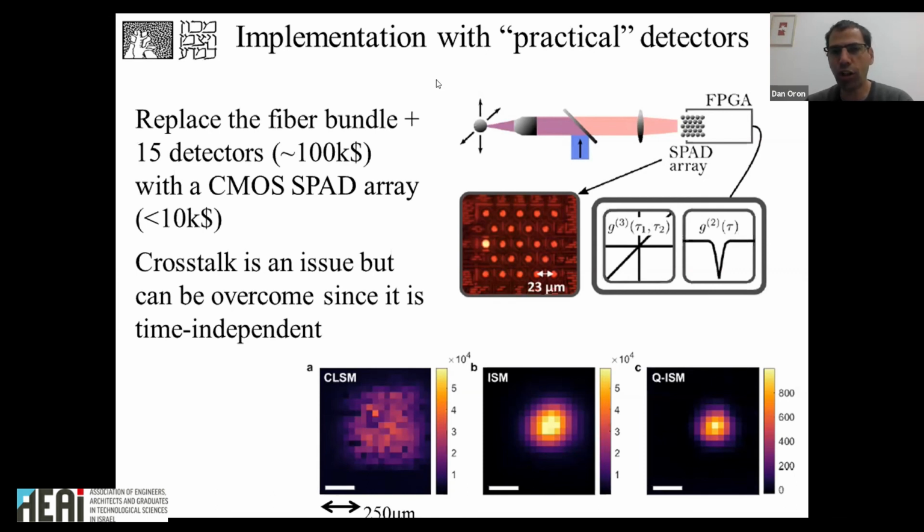However, defining the shot noise in the context of anti-bunching microscopy is a bit tricky. You can find the derivation in the paper, and I could say something more about this, but it's a bit tricky because it's a dark signal on a bright background, and the noise is not shot noise of the signal itself, it's the shot noise of the background. But yeah, it's a bit more complicated, and in fact, this is what limits this technique's practicality to second-order correlations. But we have a full derivation of this.